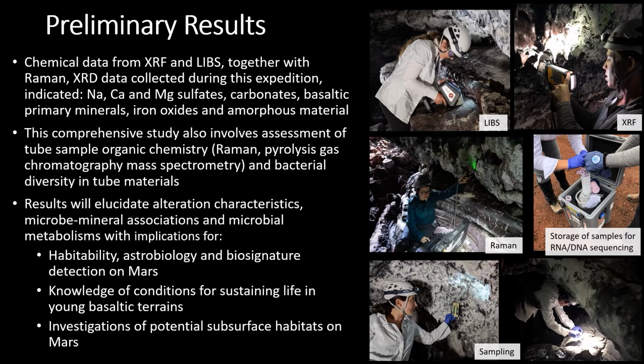And this is ongoing work, but we expect that results will elucidate the alteration characteristics, microbe mineral associations, and microbial metabolism, with implications for Martian habitability, astrobiology, and biosignature detection on Mars. Overall, understanding the conditions for life in really young basaltic terrains like this. And then we expect this work will also have implications for studying overall potential subsurface habitats on Mars.